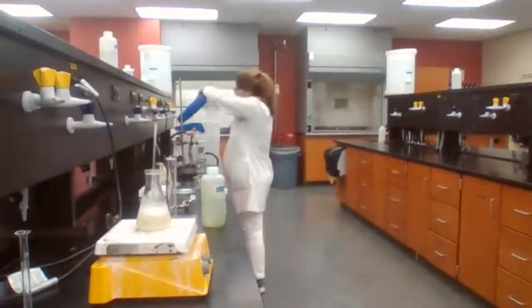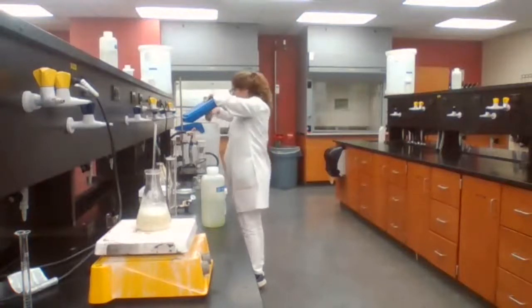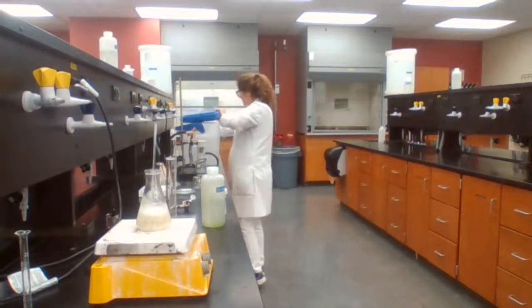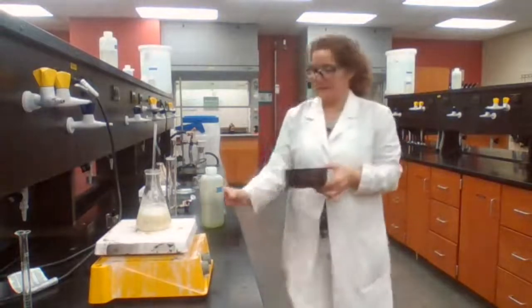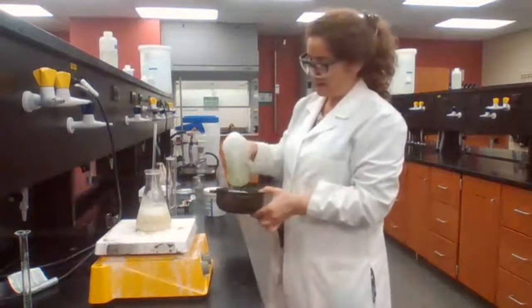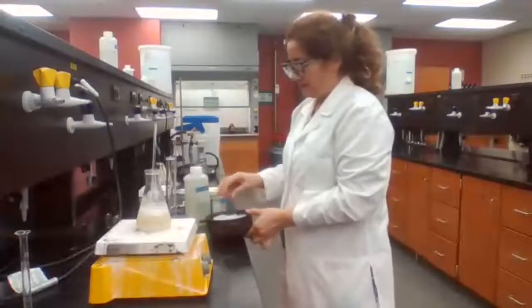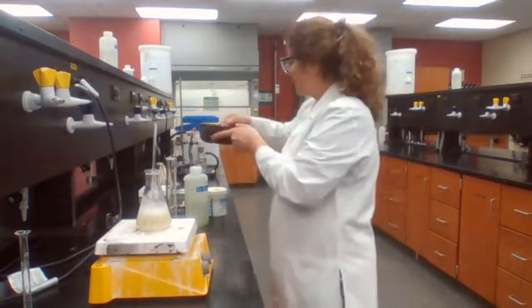So I have my ice bath ready. I add some water so it's easier for the beaker to sit in there. Just getting ready for later.